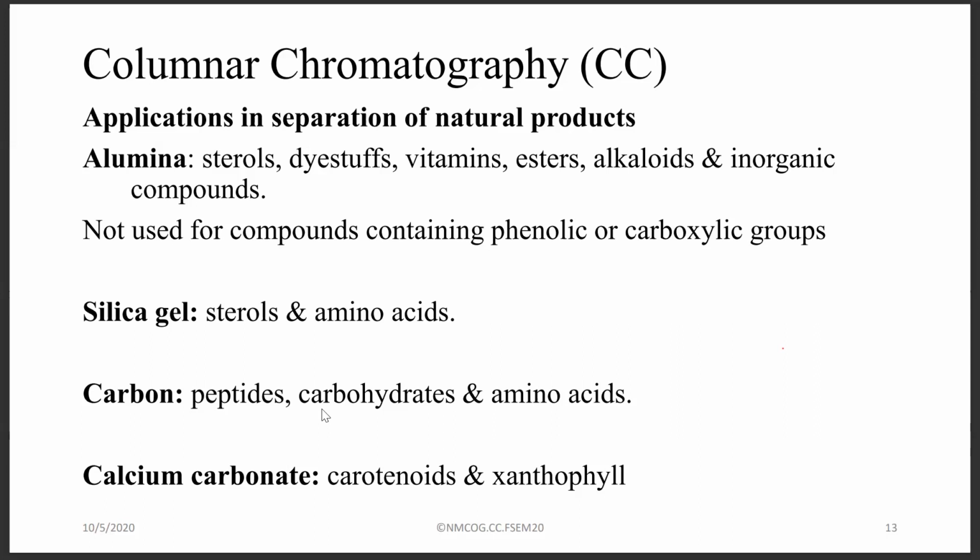So these are different adsorbents that we use: silica gel, alumina, and we can also add carbon and calcium carbonate.